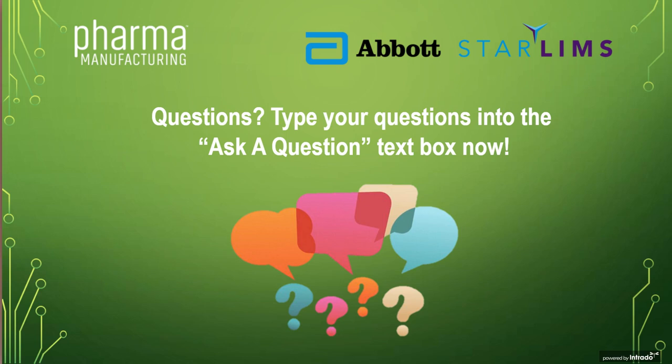Another question for either of you. How many system administrators do you recommend? Yeah, I can take that. So this is Sam. You would typically have one system administrator managing multiple systems, so it wouldn't just be STARLIMS. So typically you would have a prorated FTE when you're looking at the total cost of ownership.